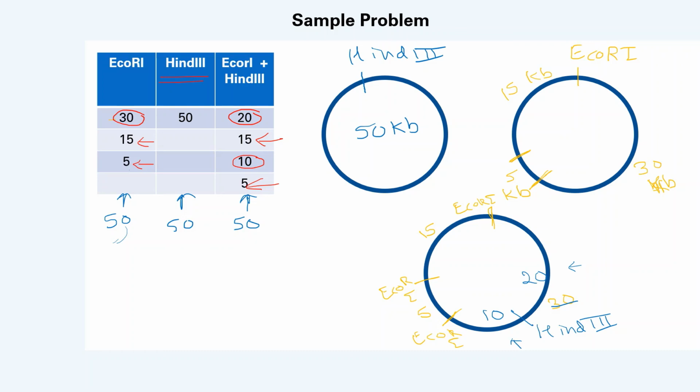It could be just reversed. So this is how you do the double digest. If you submit this, again, there is doubt where 10 is going to be, where 20 is going to be. Their orientation is not certain, but it does support the bands that you see for single digest and double digest, so it is a good estimate.